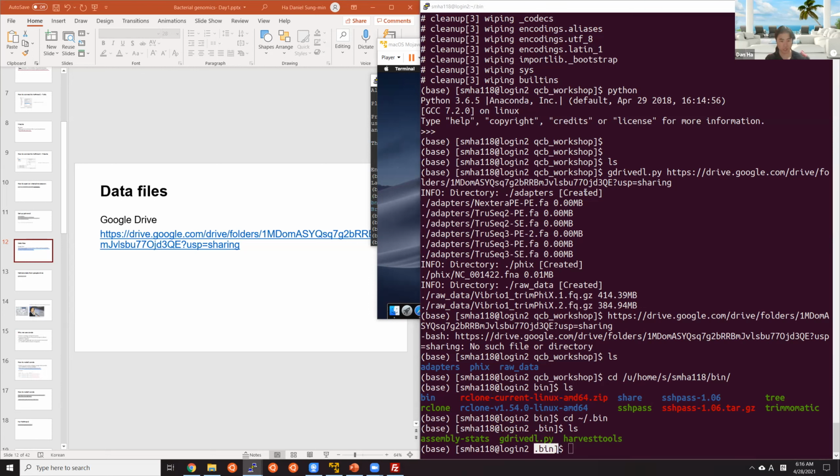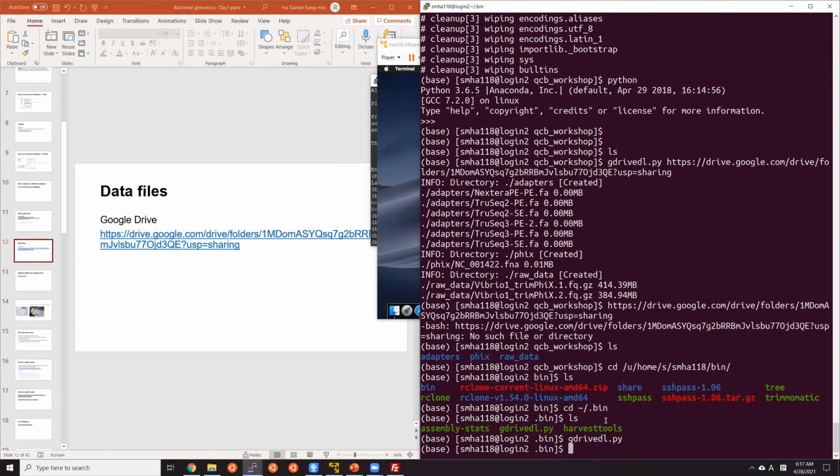You've got to be in your .bin directory. Then try it again. Is it working now? No, I just got a bunch of errors.